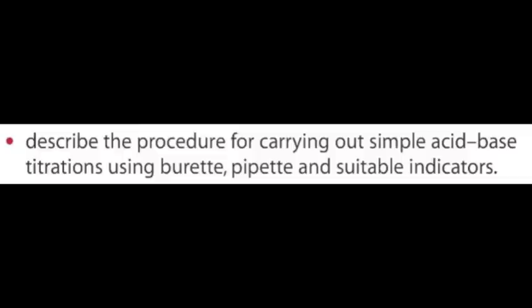Lesson number 15, Titration and Standard Solutions. By the end of this lesson, you should be able to describe the procedure for carrying out simple acid-base titrations using a burette, pipette, and a suitable indicator.